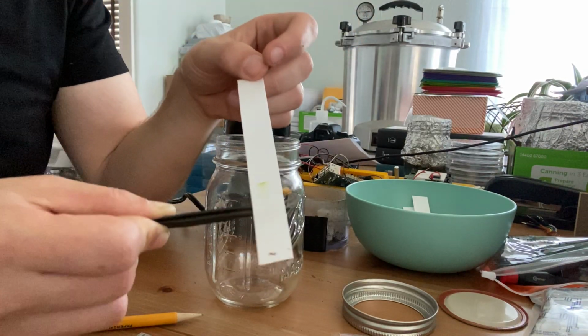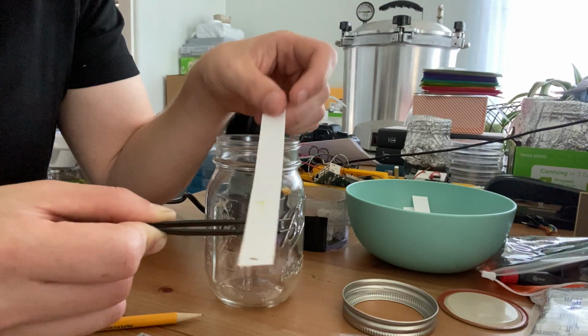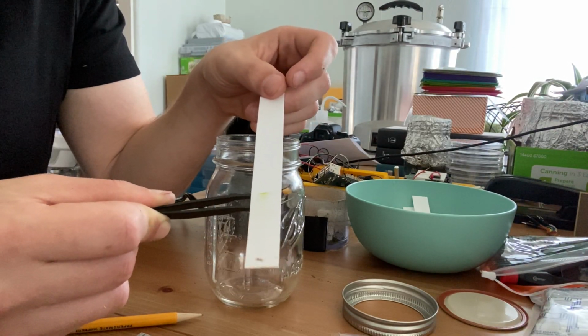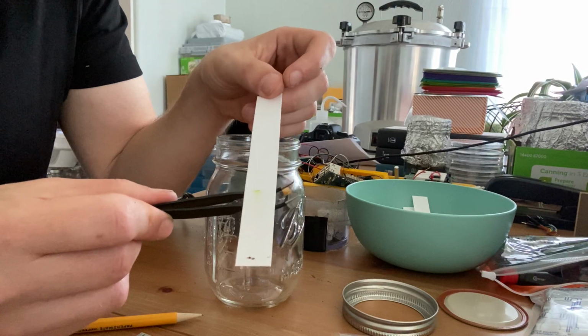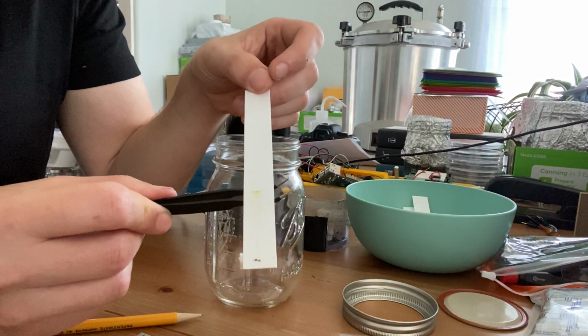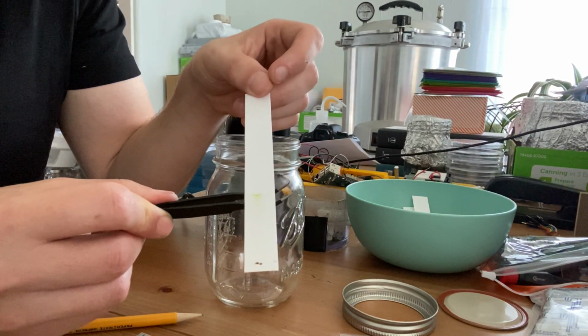And this is something that I think would be really interesting and useful for the mushroom growing community if they could actually know what compounds are in the mushrooms that they're growing, quantify them, and then use that in their breeding. Right now, everybody kind of just flies blind, and that doesn't necessarily equate to mushrooms that yield the highest percentage of the various compounds. So anyway, that's TLC, thin layer chromatography. Pretty cool.